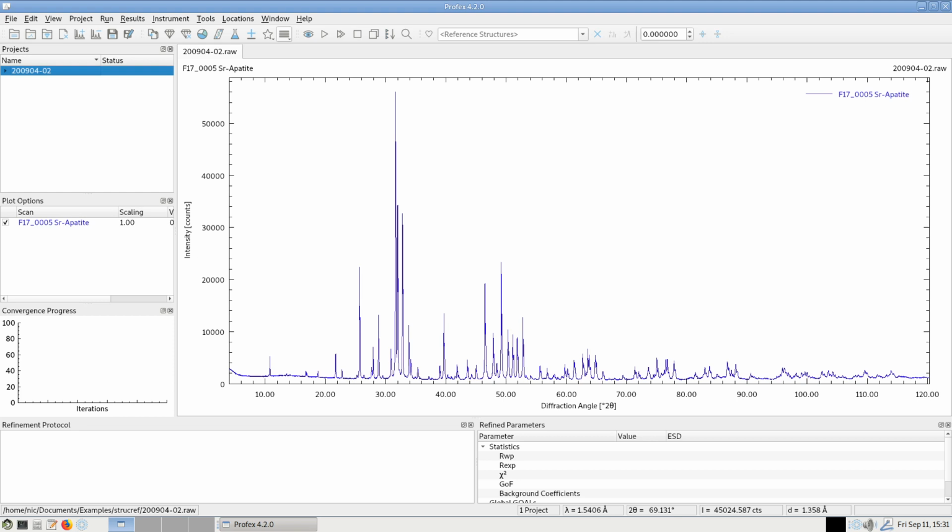This is going to be a lengthy video because structure refinement is a trial and error process, but it is a typical example of how I go about processing such a dataset when I'm interested in the refined structural parameters.